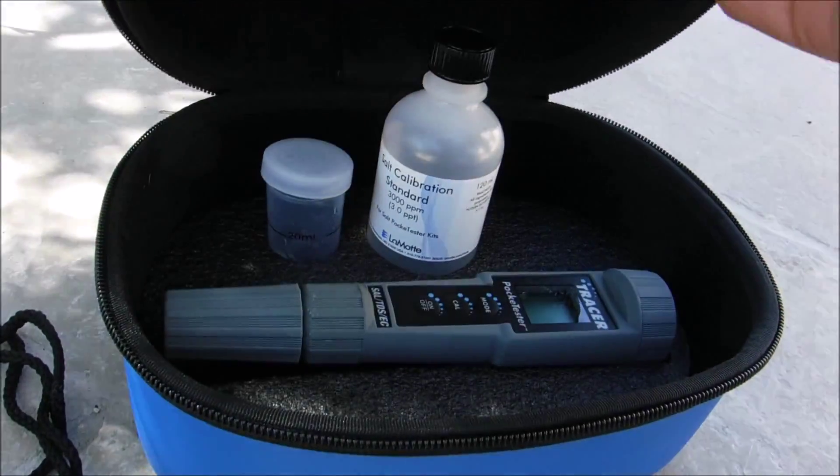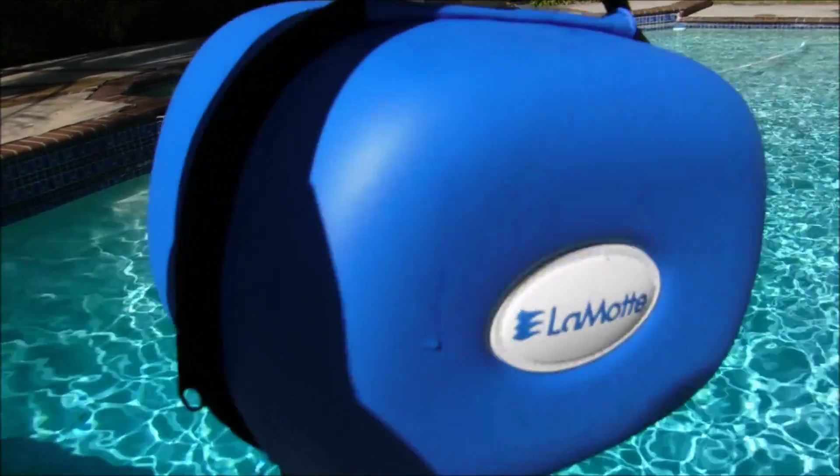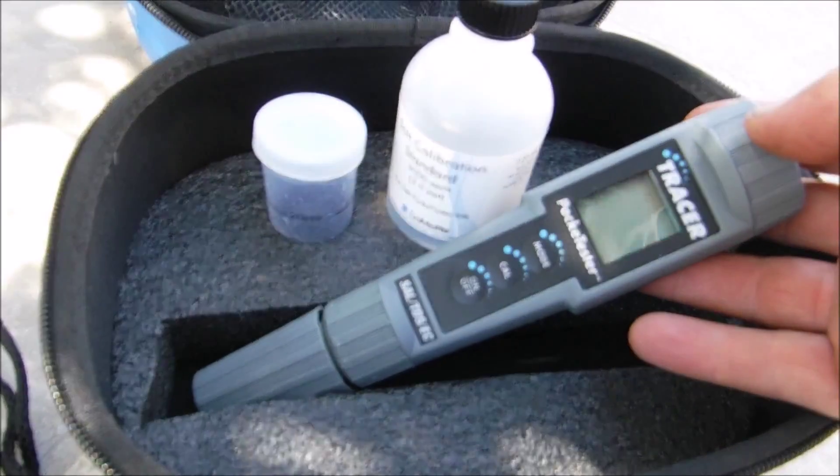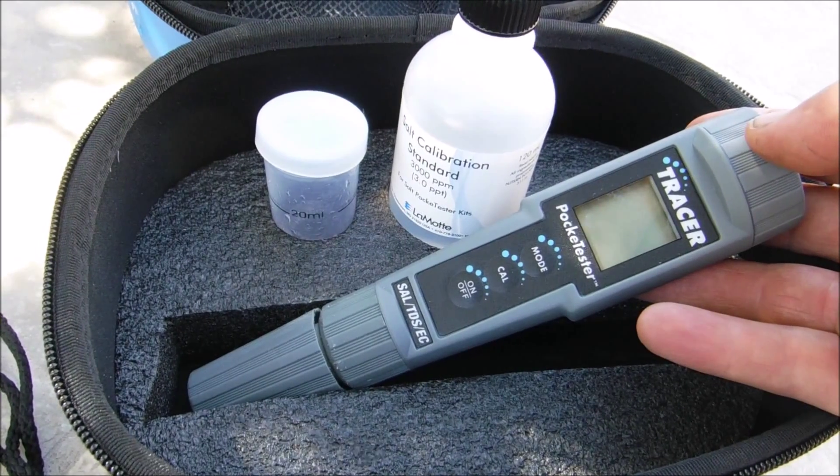I'm going to show you the LaMotte Tracer Pocket Tester. The Tracer comes in this nice carrying case — it's water resistant. The Tracer measures salinity or your salt, total dissolved solids, conductivity, and temperature.